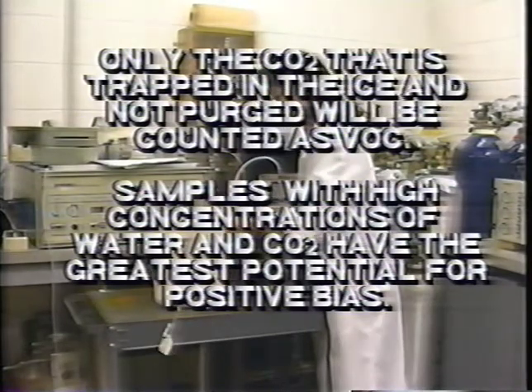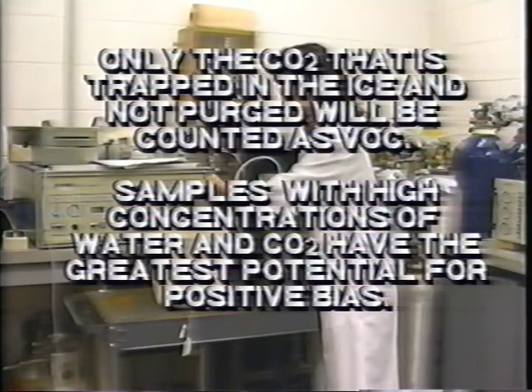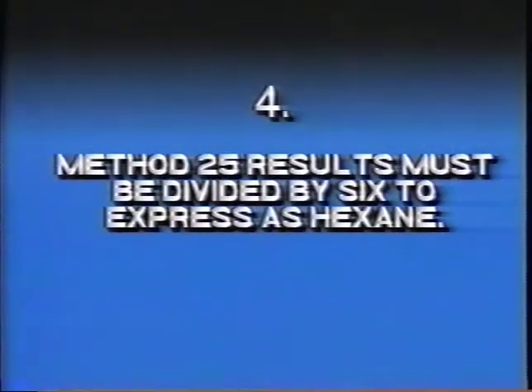Only the CO2 that is trapped in the ice and therefore not purged into the first sample tank will be counted as VOC. This is why samples with high concentrations of water and CO2 have the greatest potential for a positive bias.